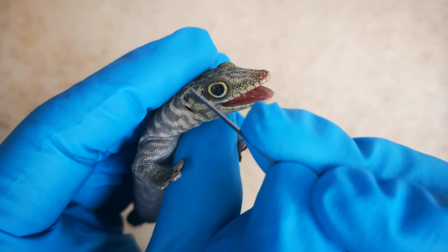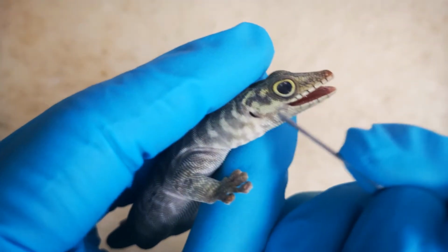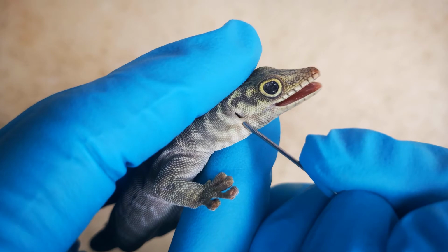Most geckos do not have eyelids, but instead have a special scale, sometimes called the brille or ocular scale, that covers the eye. Geckos have external ear openings, in which the thin tympanic membrane is visible. In geckos, pupil shape often correlates with activity period. Species with round pupils are typically diurnal, and those with slit-shaped pupils are typically nocturnal. Phelsuma standingi has round pupils, though you cannot see them in this specimen.